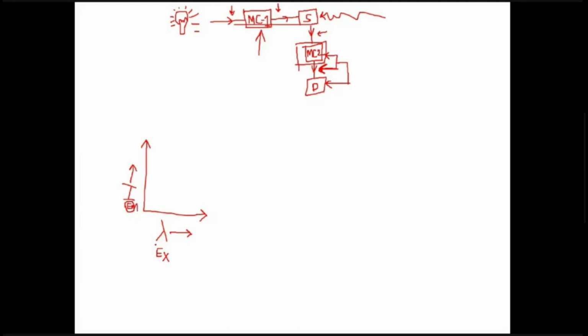This is emission and this is excitation. In absorption, what we did, we changed the wavelength and we measured the same wavelength. But here we are changing a different wavelength and we are measuring the intensity of an emitted wavelength. So as the excitation wavelength changes, there is no change in the intensity, or it is very less intensity of the emission wavelength.